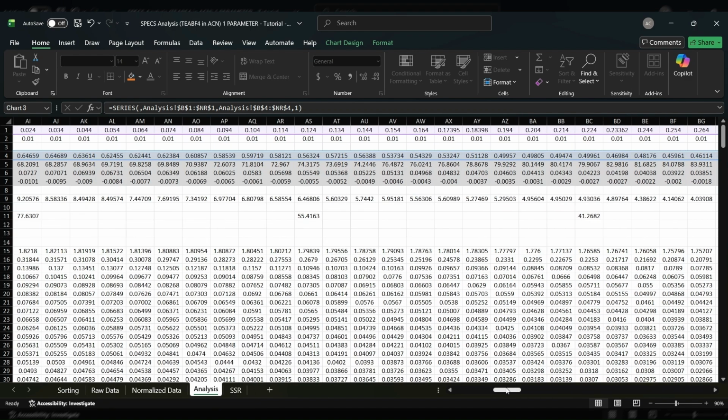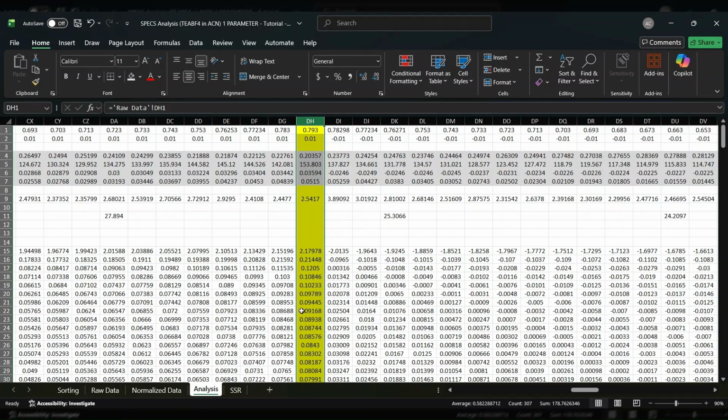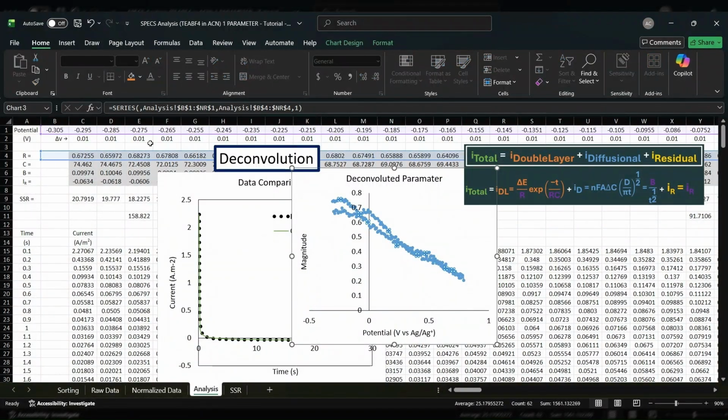For you at home doing this, I would be happy with any software to deconvolute this for you, but I would always just watch for the crossover point, because you're going from a positive potential to a negative potential. You have a very big change. So for me personally, once I get to the crossover point, I manually take care of the deconvolution part, the solver part, and then get it to start again once it's got some pretty good guesses going and I'm confident that it's stable and doesn't do anything funny. Yeah, just keep an eye on your data.